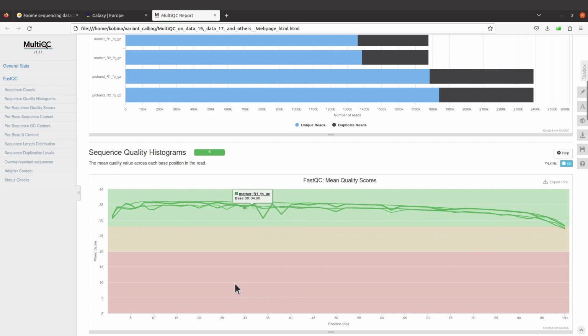So that's a quick way to assess the quality. Here we see that all the FASTQ files are in this region. That indicates that they are all of good quality. That's what we see here. But with Illumina paired end reads, normally the qualities drop at the ends.